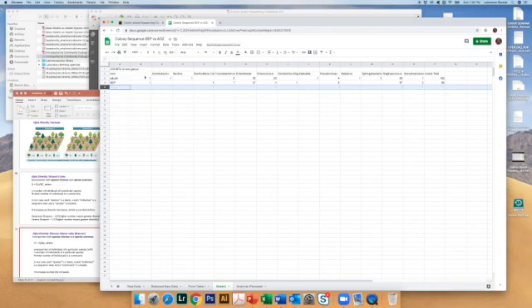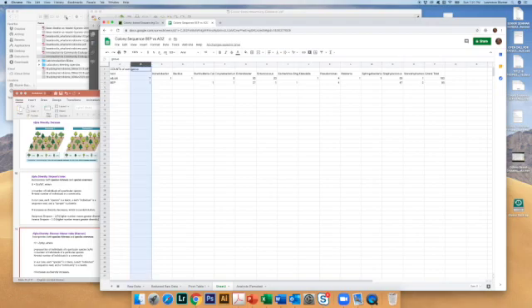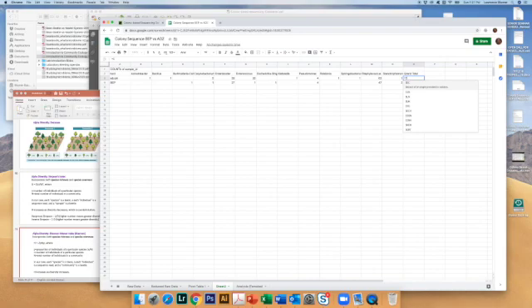The unidentified genera isn't very useful to us. I would delete that. And then, of course, the grand totals are not going to be correct, so you're going to have to calculate those. So I would delete the value, just as we did before, indicate sum, make it the sum of the entire row, hit return, drag down, get the other one. And now you're ready to go ahead.